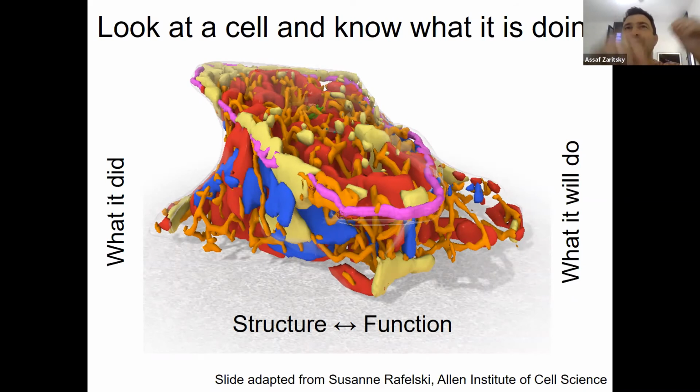And then also the optics is different, because when you image your cells there are wavelengths that interfere with one another, and then you need to computationally resolve them. So it's really a huge limitation. And the world record, the nicest papers that came out, because of these technical limitations, most of the field was working molecule by molecule, organelle by organelle.